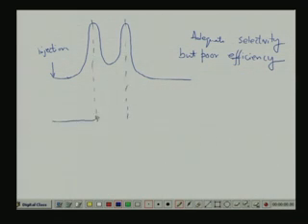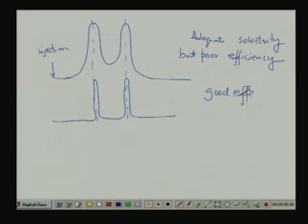You see here, good efficiency and selectivity. These are the desired characteristics, efficiency and selectivity. Okay.